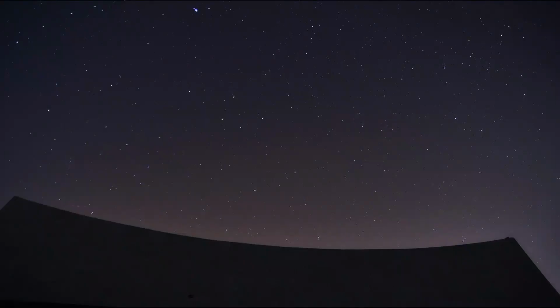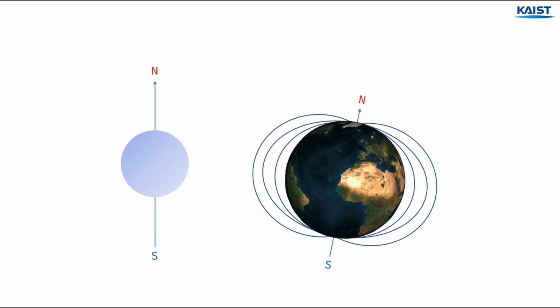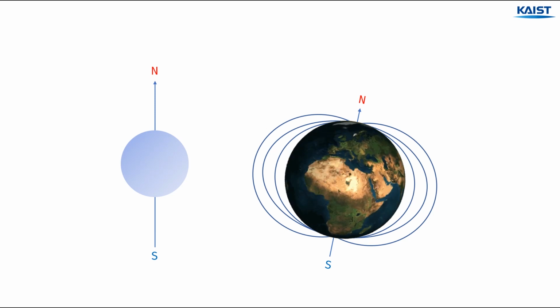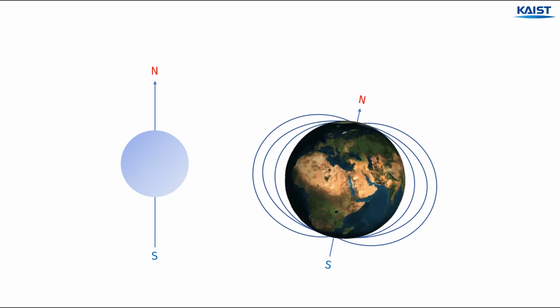But can we say nuclear spin is classically rotating? The nucleus is very similar to the Earth. Firstly, they have their own magnetic field, and we say they have spin. Earth is literally rotating. Then is the nucleus also rotating like the Earth?